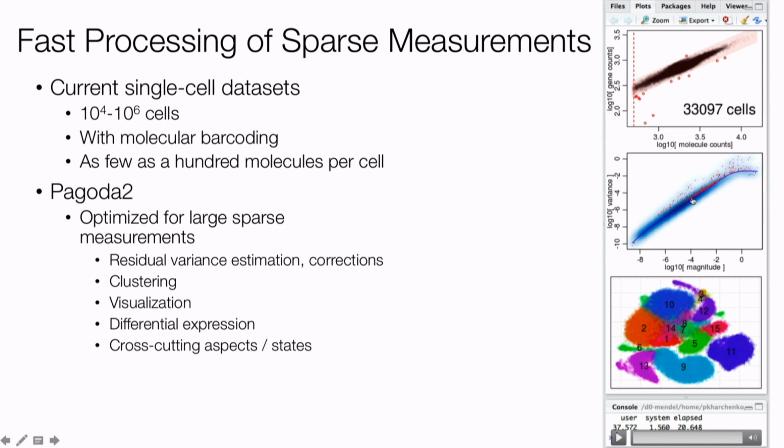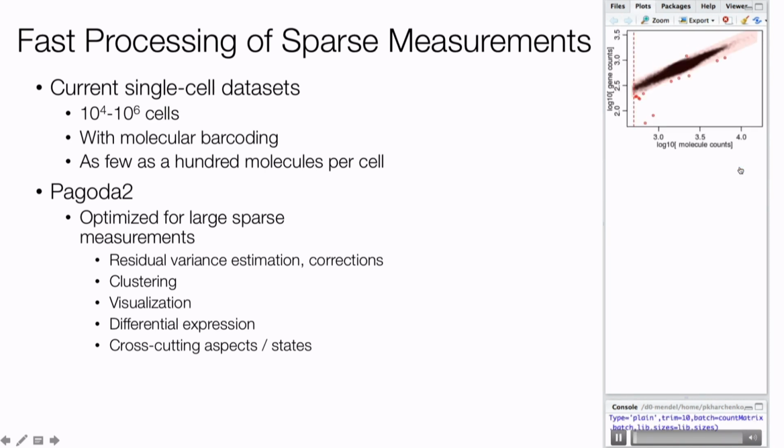It's usually higher than that, but we could fit this type of distribution and then essentially look for genes that show variance that is higher than expected by chance or expected from this type of a model. This model is gene relative. You can have models based on controls and other things. But essentially, once you fit this type of thing, you can renormalize the variance of genes, right?